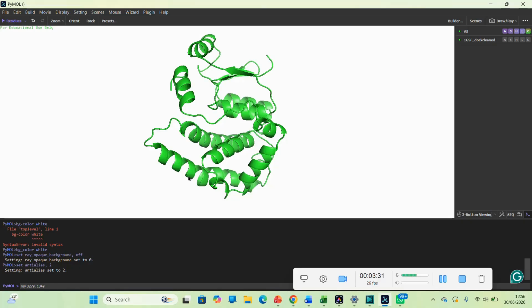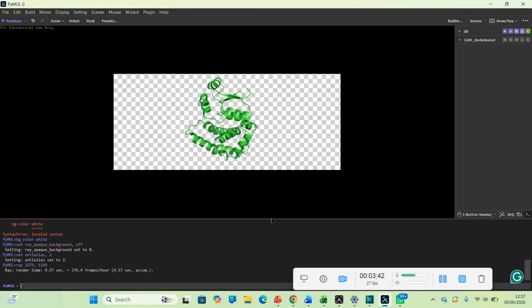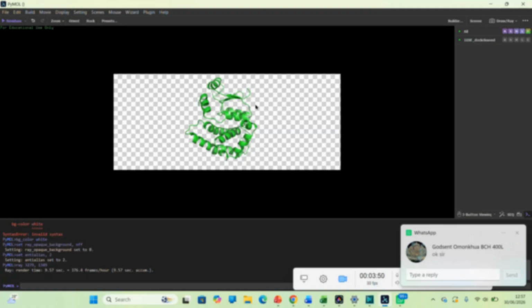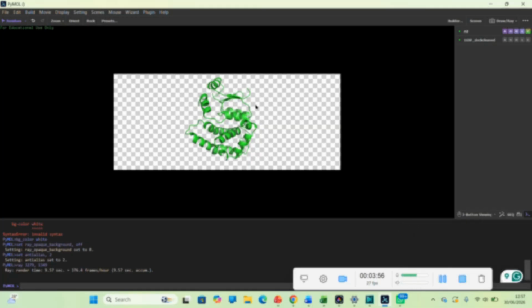So if we now click this to run, we give it some time for it to process the whole command. So now it has processed it and we can see that we have this. It depends on what you want specifically. You can see now that the height and width cover much area that is not required.